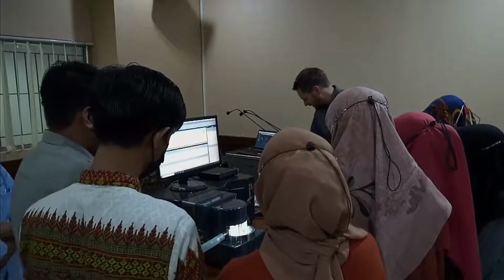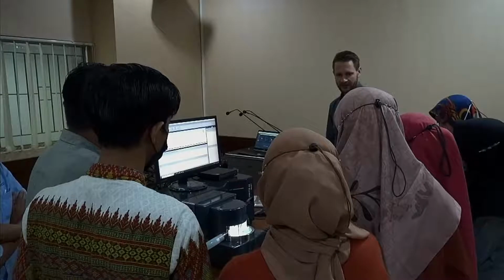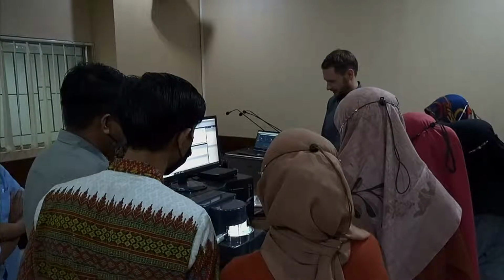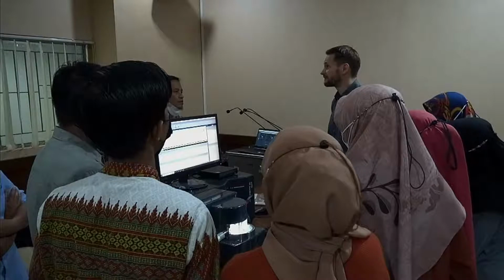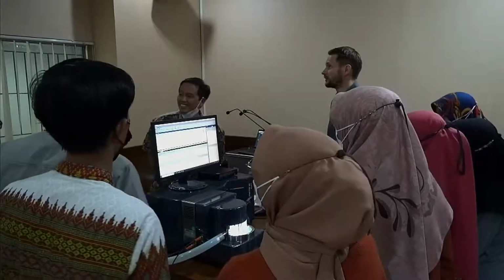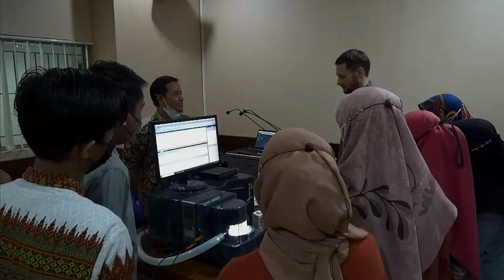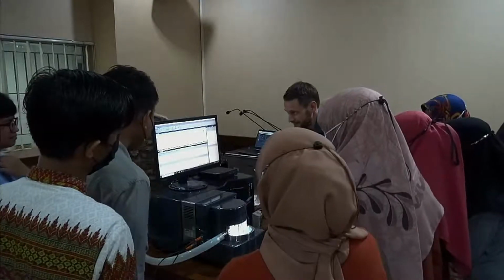So I'd say the next step, let's measure something a little smaller, like coconut cream. Well, we have 15 minutes, you say, per group. 20 minutes. Okay, you keep an eye on it. When did we start? No, 10 minutes already. So another 10 minutes. Okay, then let's try to be quick.